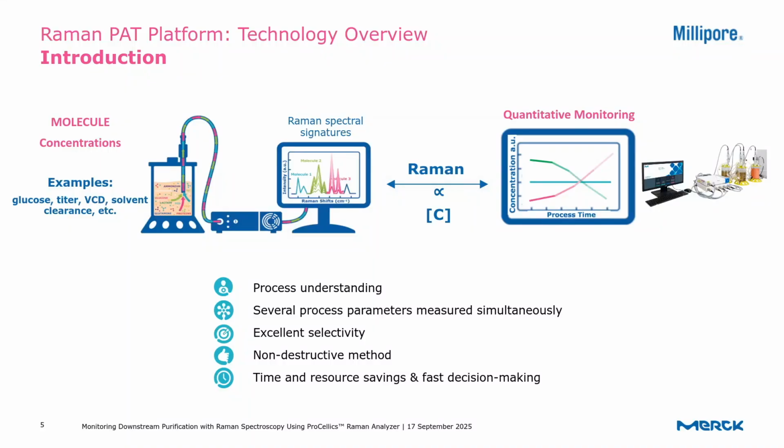In that process, it's outputting real-time analytics, which you can then use to communicate to your process controls and make real-time decisions about your process.